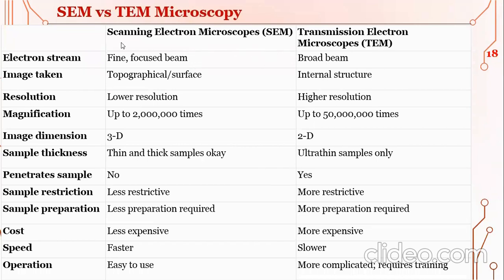The electron microscopes. But in the case of the STEM, it requires higher resolution and higher magnification, so they are more energy intensive, and they need to maintain high voltage. So the voltage should be maintained in a constant range, so it is more restrictive, and this is less restrictive, so this one is more sensitive actually, and the rest is okay. That's good.